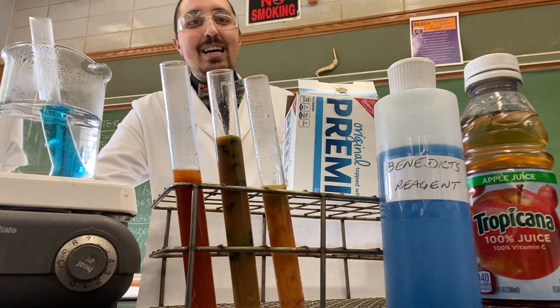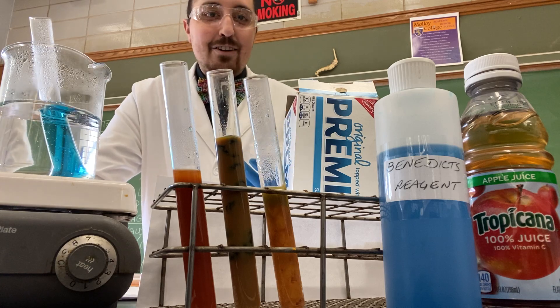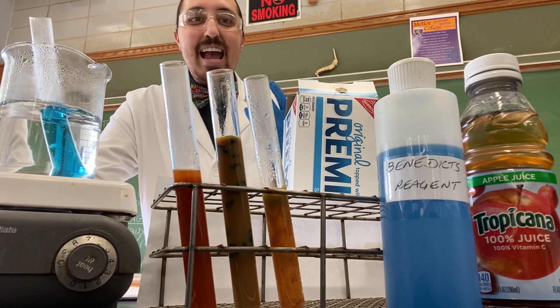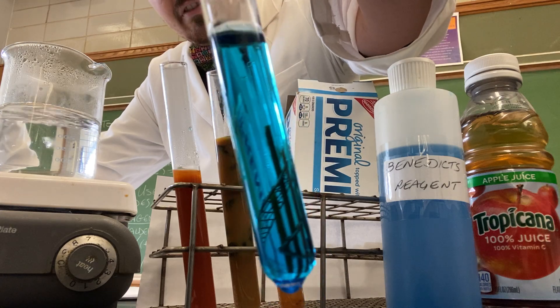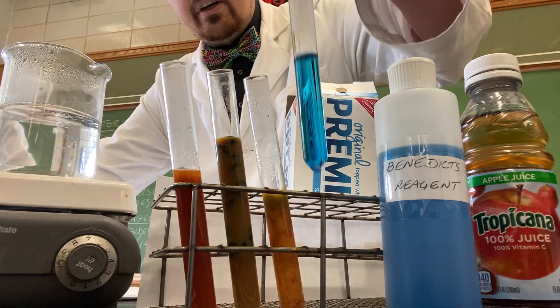The last thing we did is we threw in some water and Benedict solution to act as our control. Remember, our control group will show you what a negative test looks like. Here's our water and Benedict solution — you will notice that it is that light blue that we saw a little earlier.